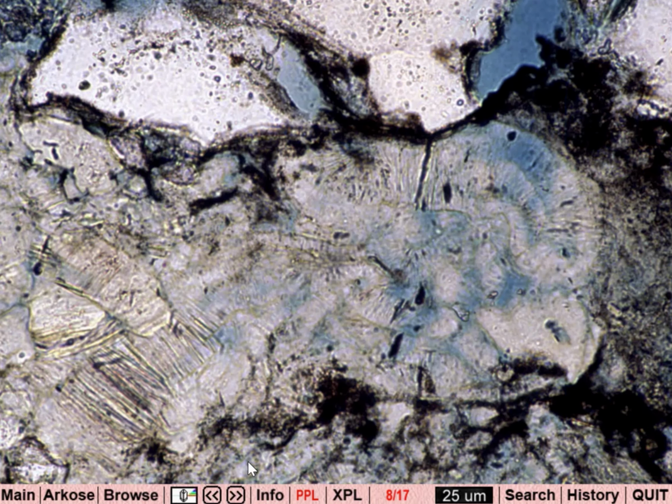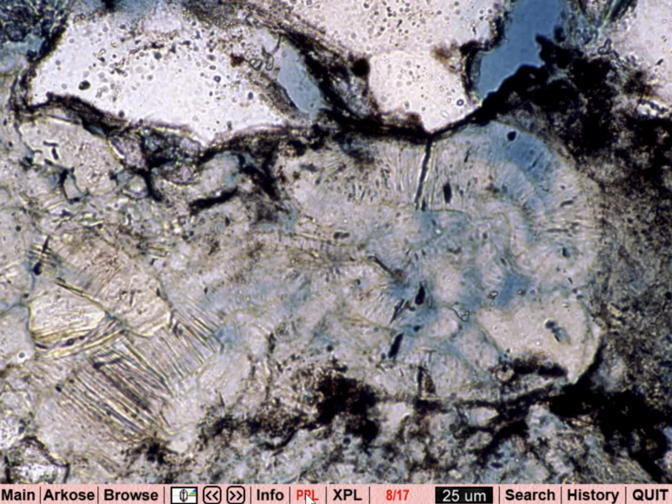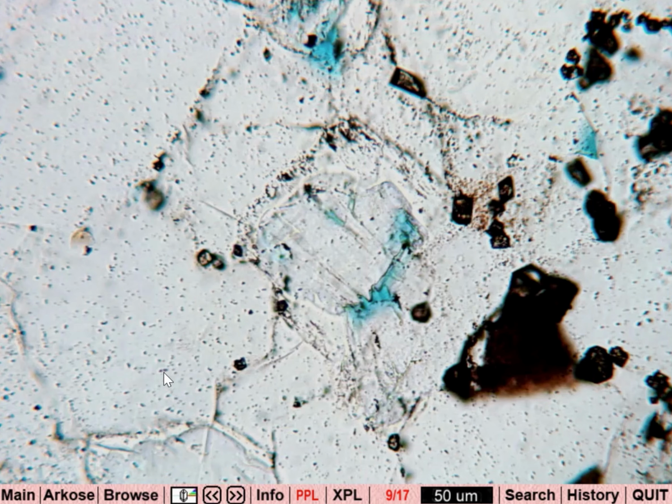Okay, a zoomed in look showing how the kaolinite has some compaction and this vermicular texture. Okay, notice how that area has such high birefringence. The kaolinite is actually starting to grow a white mica. So we're really on the borderline of some metamorphism, low T metamorphism.